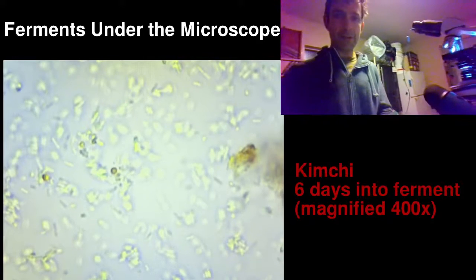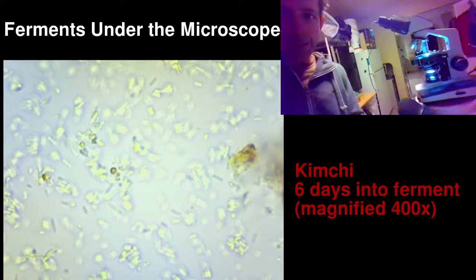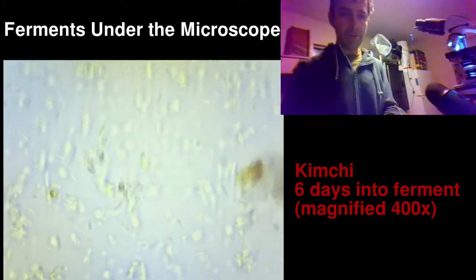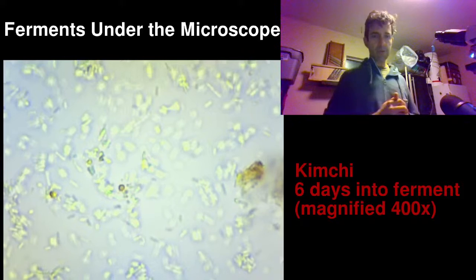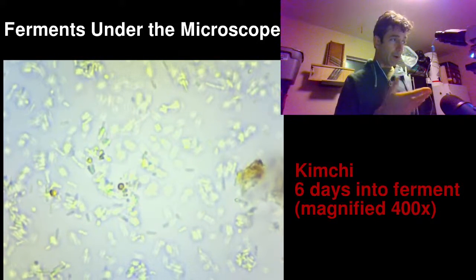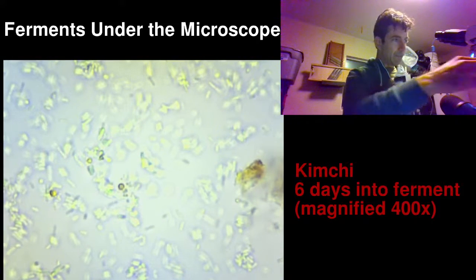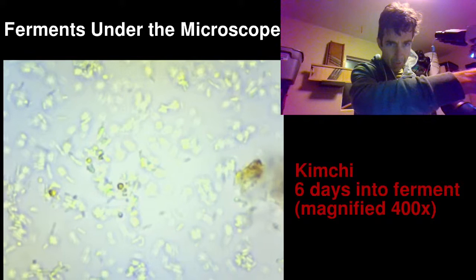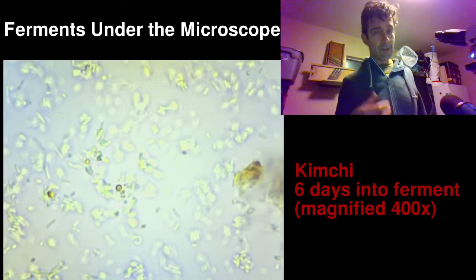You put that together and then place the slide onto the microscope stage, where the light is emanating from beneath. Then you just focus and dial it in to the right magnification. So really what we're looking at right now is that droplet I took a couple hours ago.